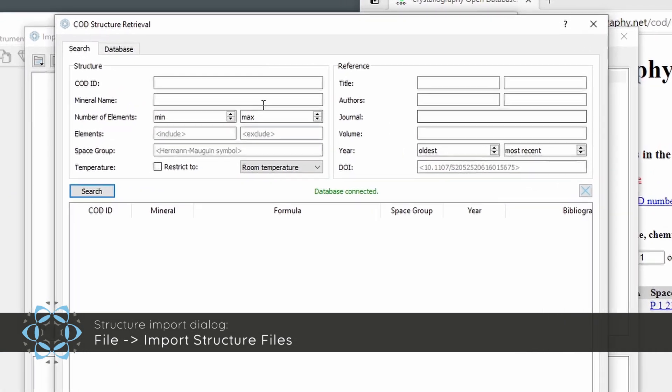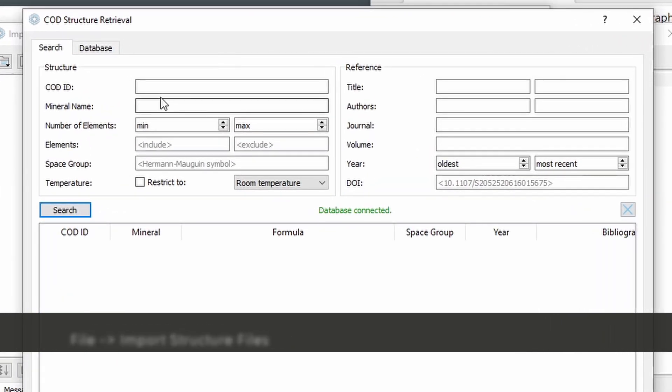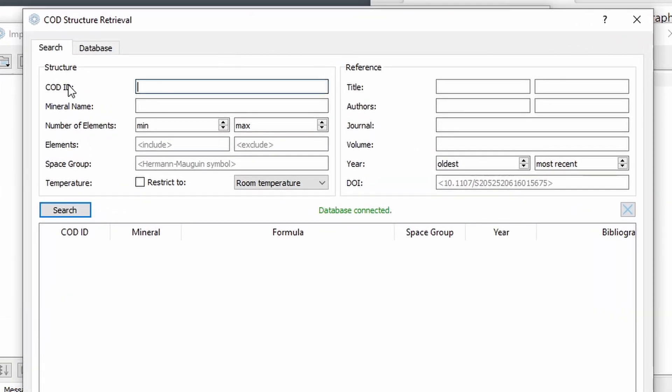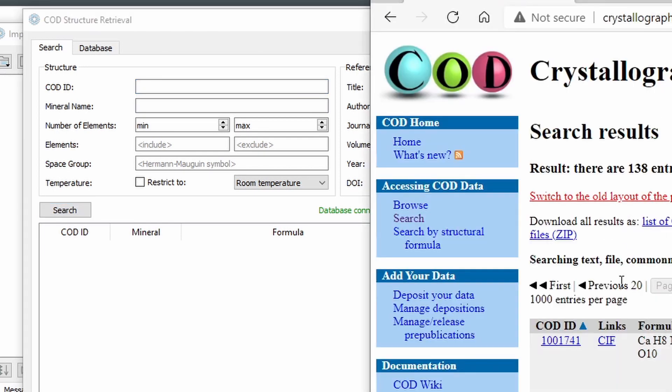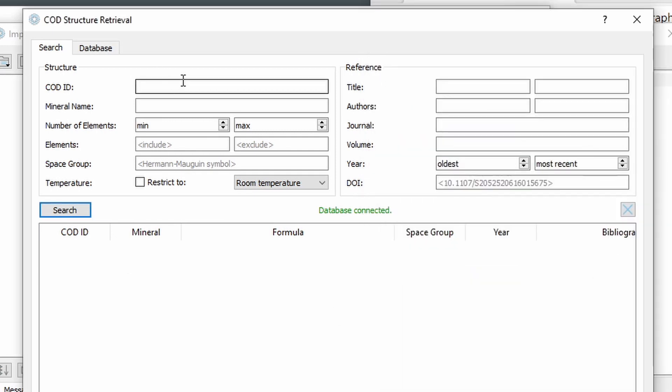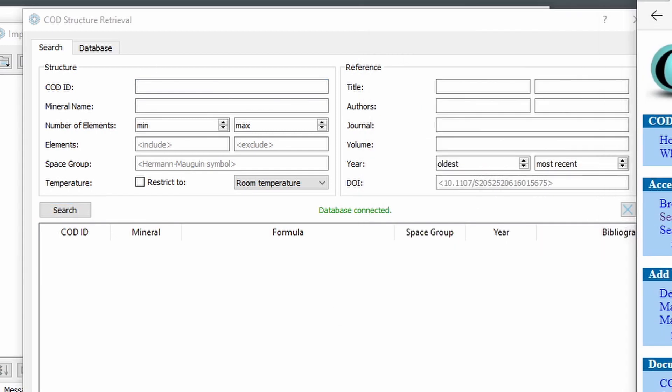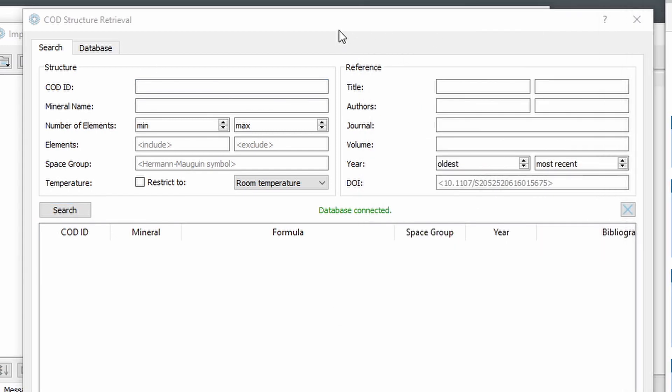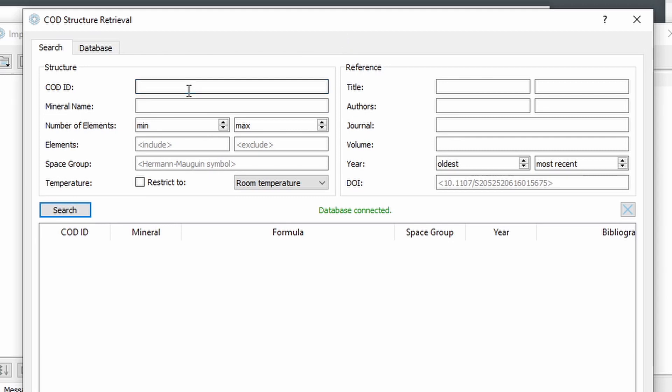Now we have two new search fields, the COD ID and the DOI, the document identifier. And this is convenient if we already know the ID of the structure files we want to download. For example, if we search on the COD website or if we just know which structures we want to download, we can now enter the IDs directly in this field.